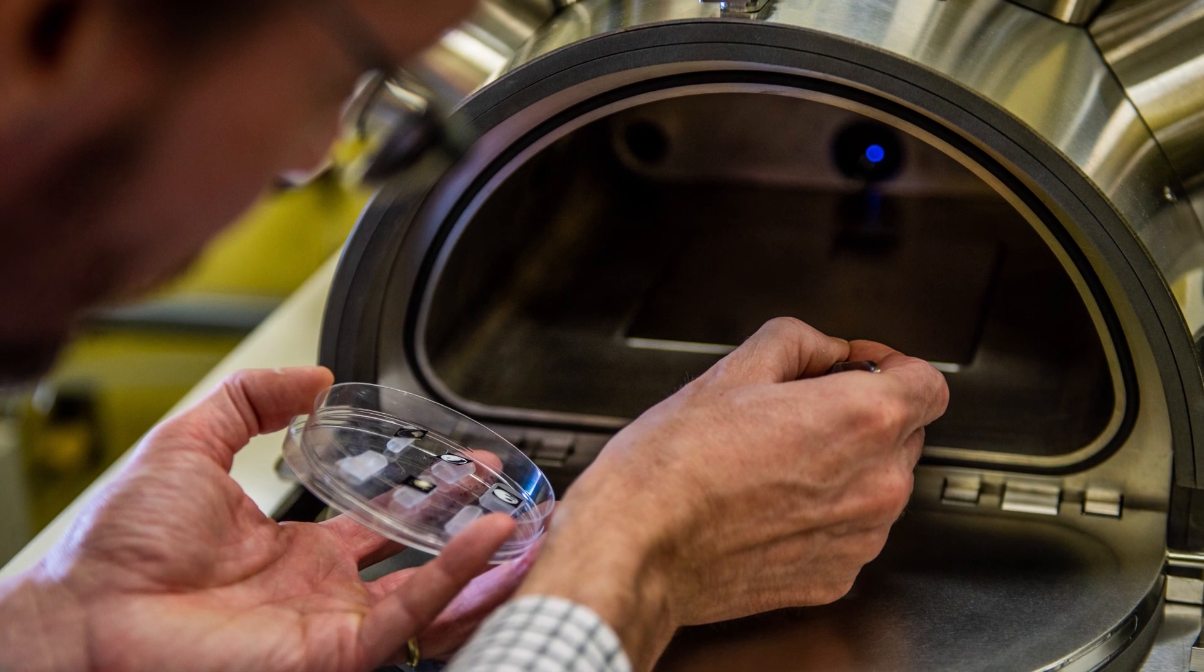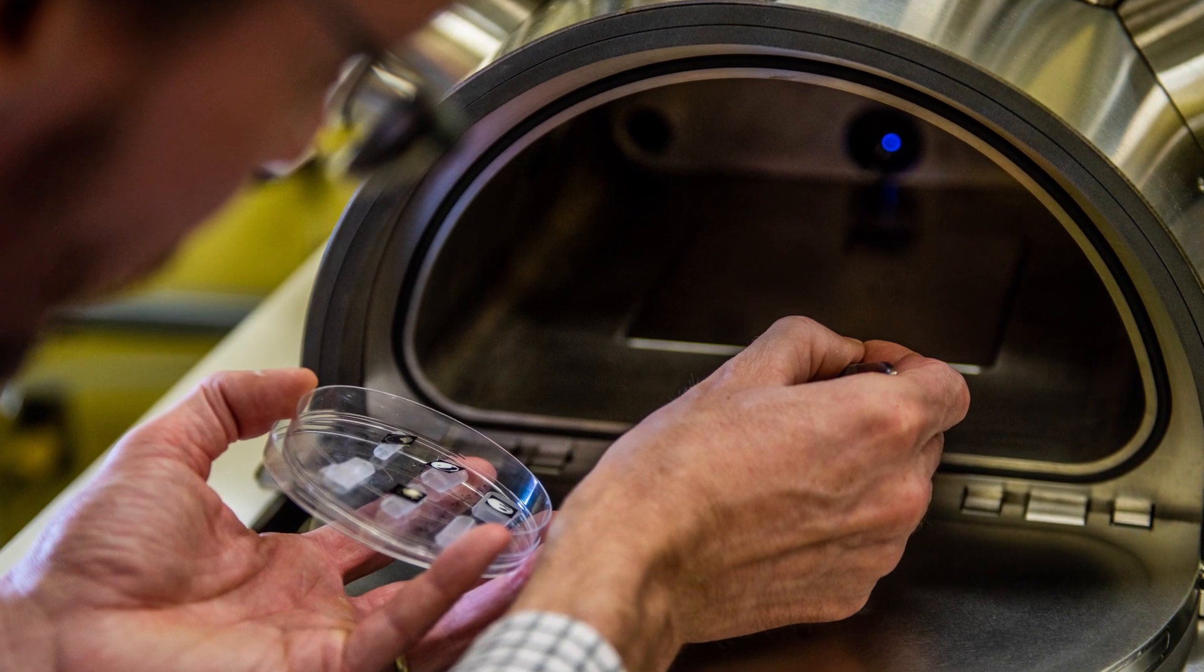We're currently the only lab in the world with such a planet simulator. Many other labs are now planning to build such a device, but we are for now the first ones, thanks to Engstrom Engineering.